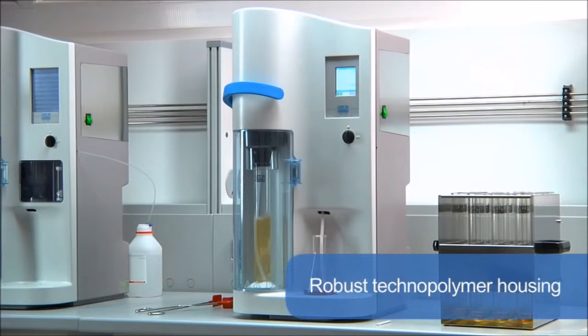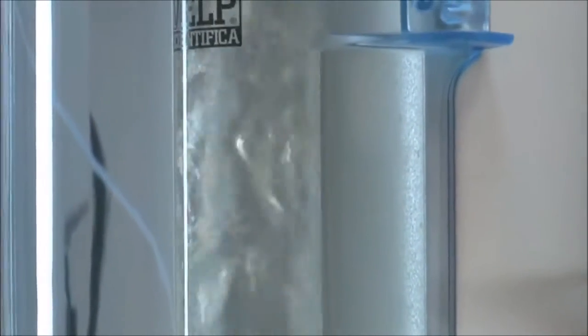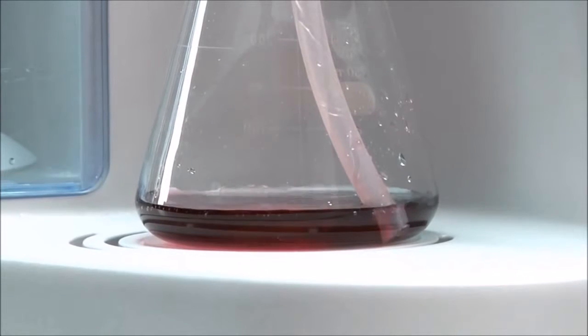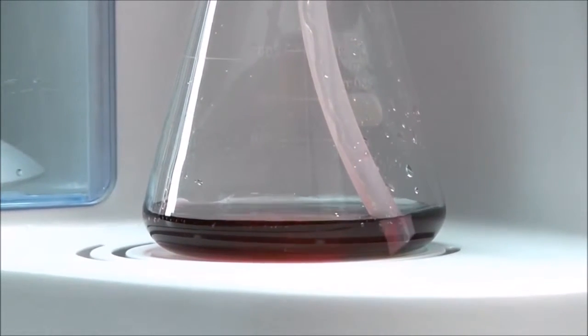The UDK 149 has been designed with a highly resistant technopolymer housing for unprecedented resistance and space-saving footprint. It is equipped with all the devices to improve safety and convenience of use, including the exclusive safety lever, the protective door and the service door.